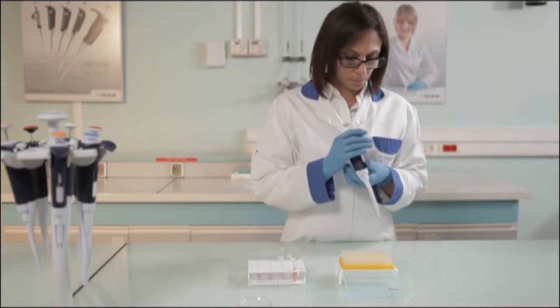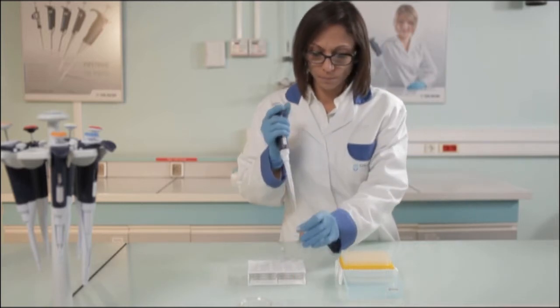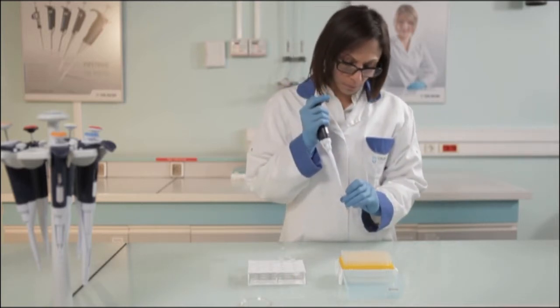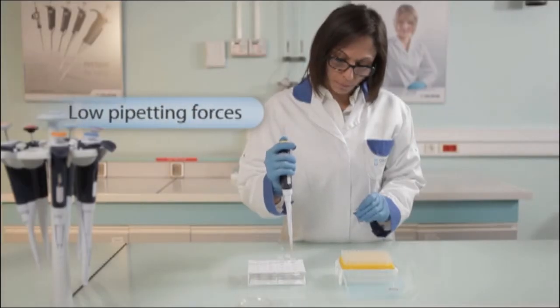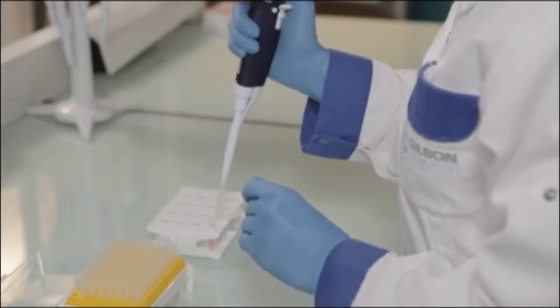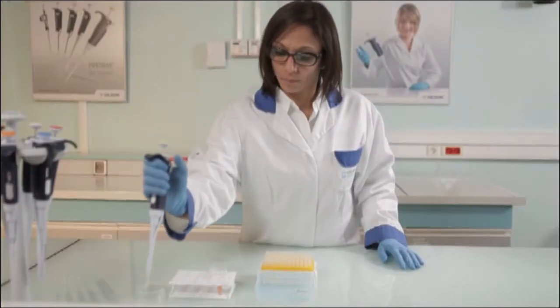Once the thumb wheel is locked, the volume won't change. You can now start pipetting with complete confidence in your results. In addition to extremely low pipetting forces, the tip ejection has never been so easy and comfortable.